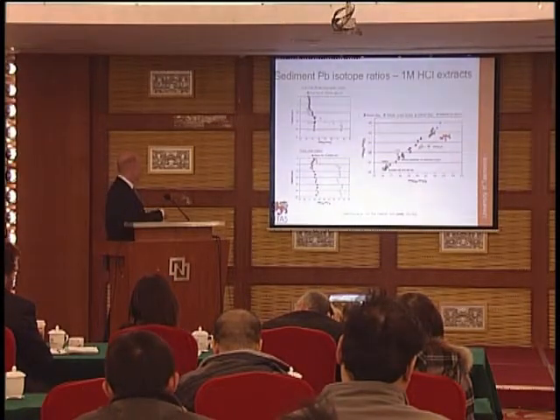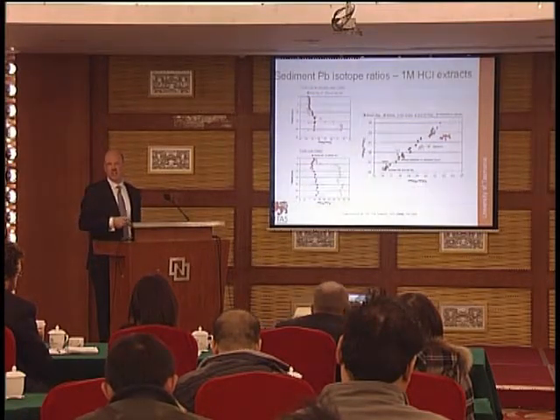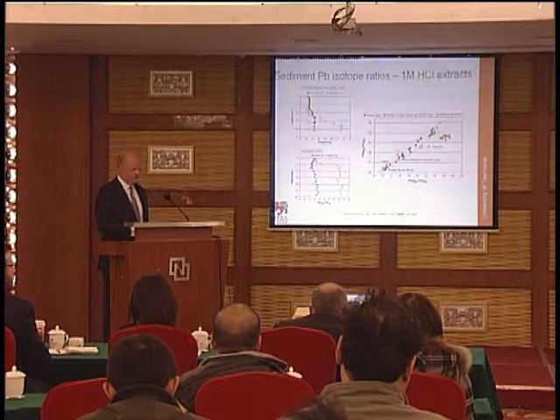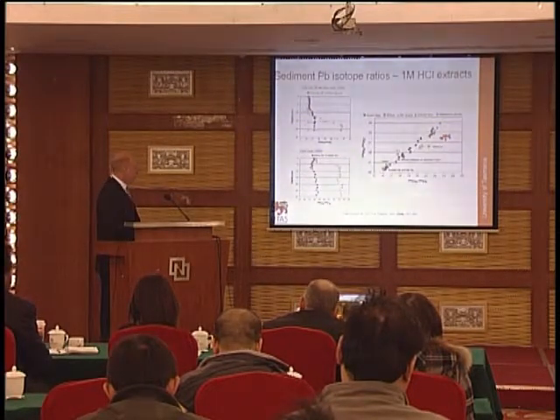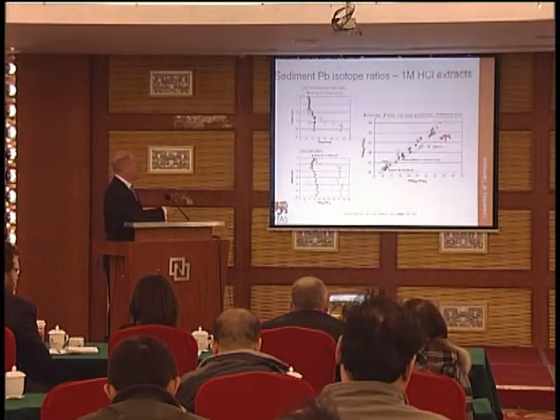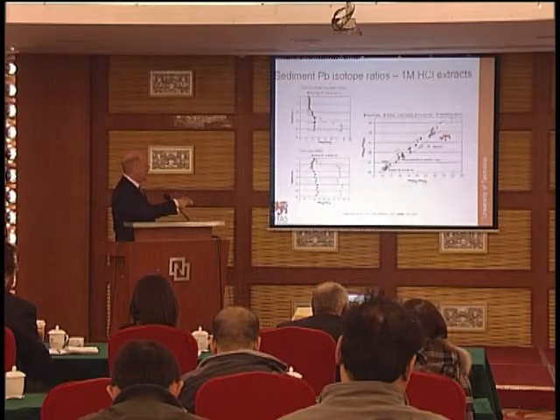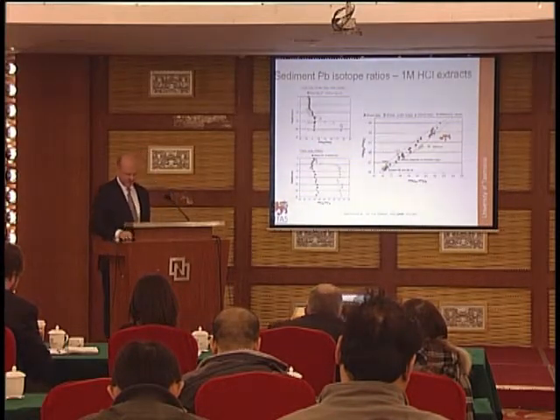But when we look at a 1 molar HCl extract, we see a much clearer differentiation in the isotopic record. So this is a very sensitive indicator of the impact of the contamination. And over at Wilkes down here, we can see the same thing. Using a 3 isotope plot, what does it tell us? Well, very simply, putting the ring around the Australian lead samples, the samples that are near the Australian base are tracking down towards Australian lead signatures. Nothing surprising there, and that's what we expected.